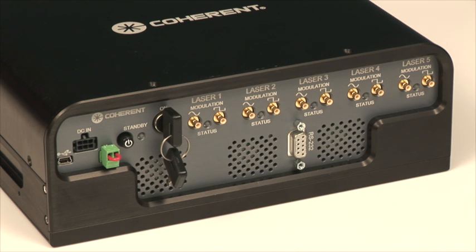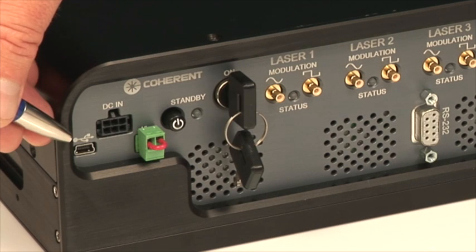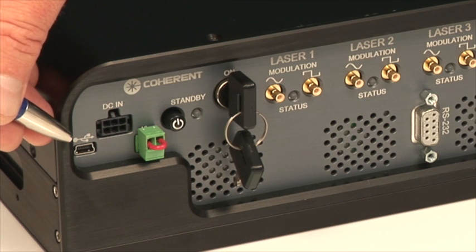The laser box offers a plethora of features that include a USB connector for remote access to all the lasers. The USB connector is addressable so each of the five lasers can be controlled independently through one USB port.